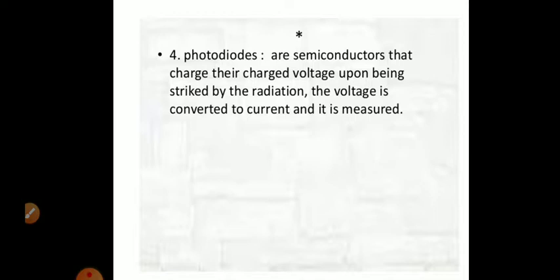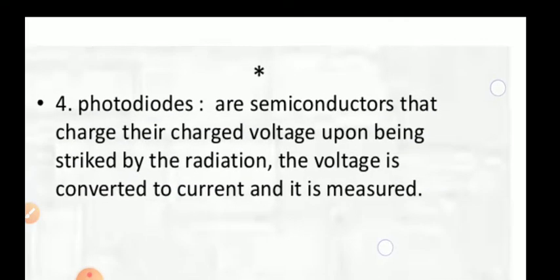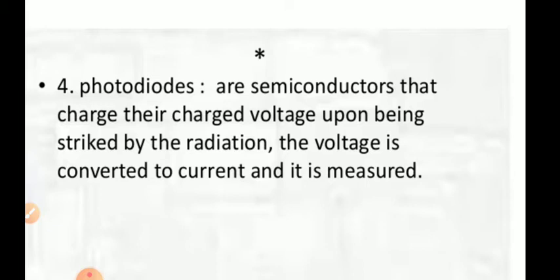Actually, it is designed to measure low light intensities, and if the initial light intensity is high, it may not be suitable, it may not be sensitive, but still they are of great choice. Photomultipliers are of first choice to be used in UV spectrophotometers.